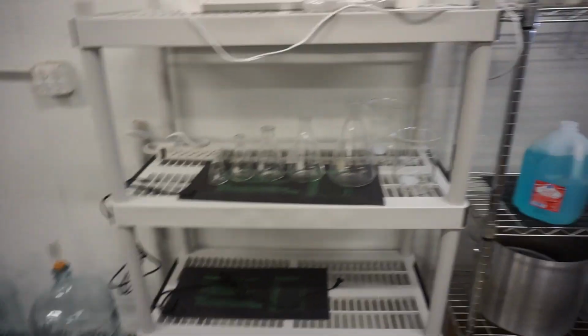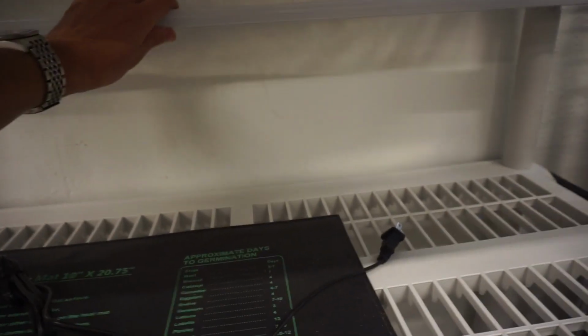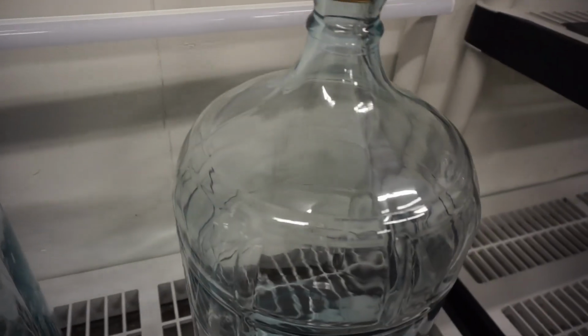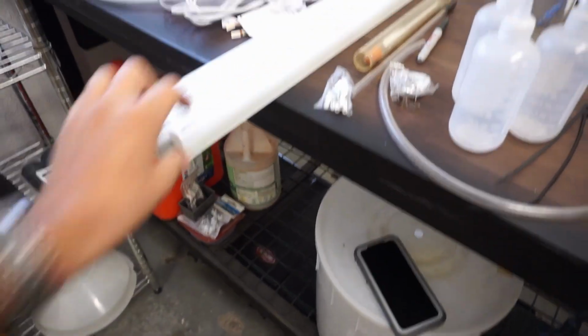So after we get all this stuff set up, I've also got these 4 lights here. God, it's so washed out over there. These 4 lights here, which are just regular white LEDs. So this one's gonna be on the top shelf, and then 2 of these will be down here attached across the back like so. And then I might have to get a couple more, another set right here for these guys, for the big carboys once we move up to that size. But it's gonna take us a little bit to get to this size, so I'm not too worried about getting that portion of it done right away.